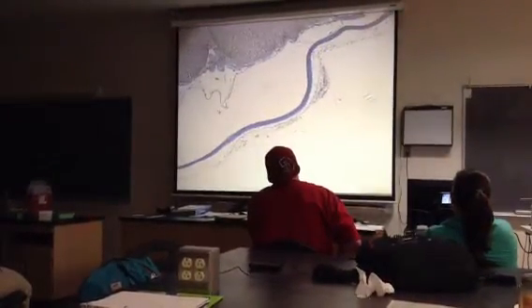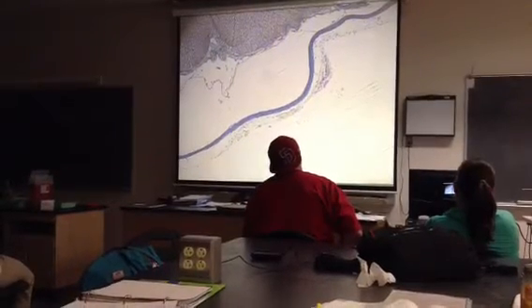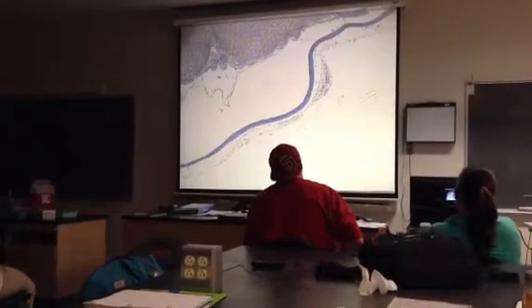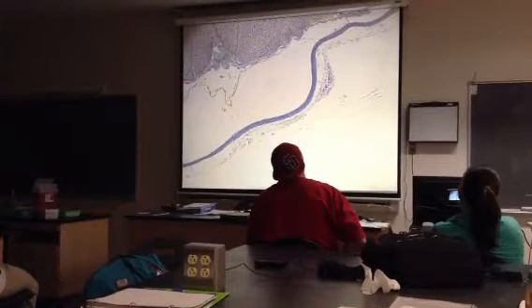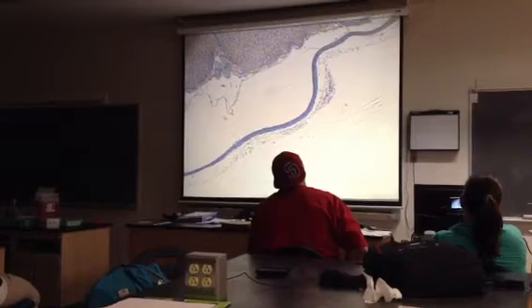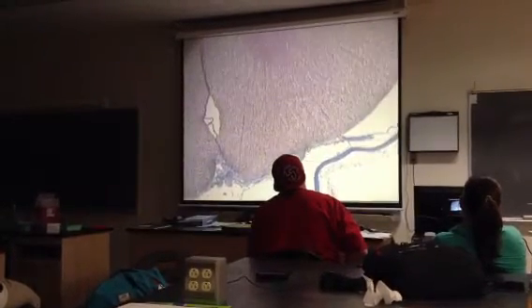Out here, somebody called this, what's somebody called that? The floating layer. This is what? Yeah, that's the dura mater. Okay, the arachnoid kind of fell apart. The pia mater is this one that's right on top of the spinal cord. I know on your list it just said spinal meninges, but I wanted to at least show you the dura mater.